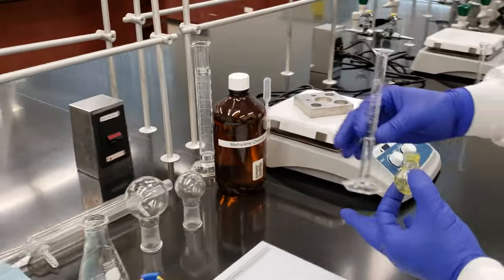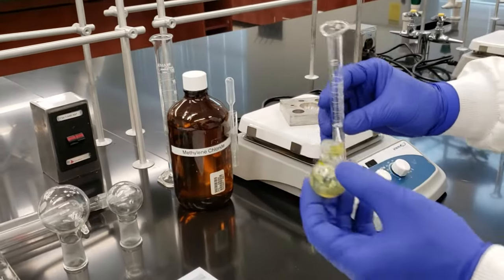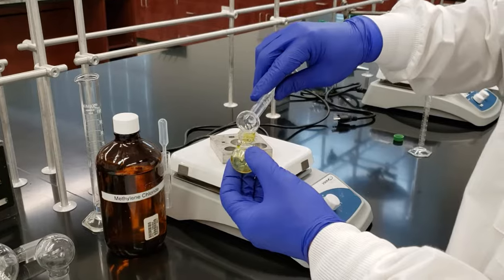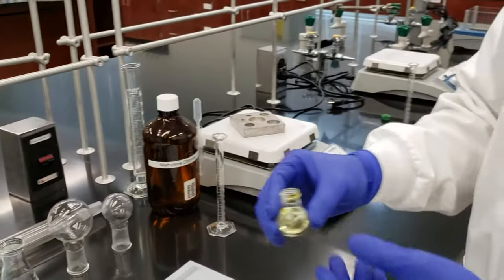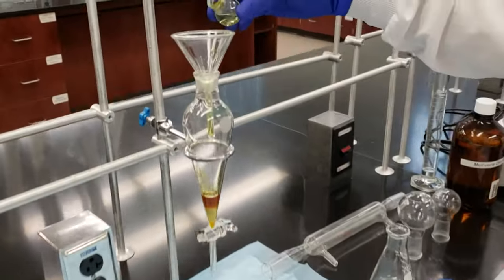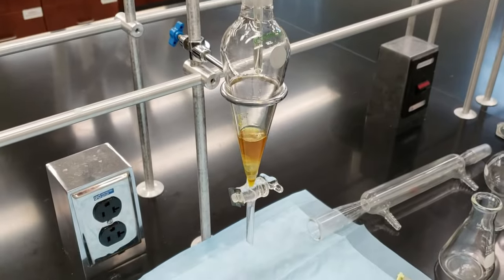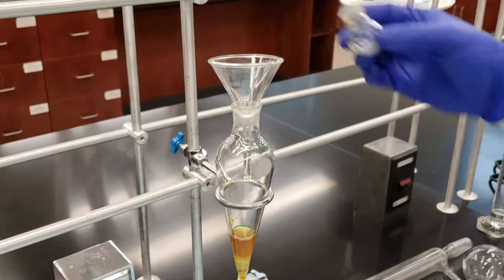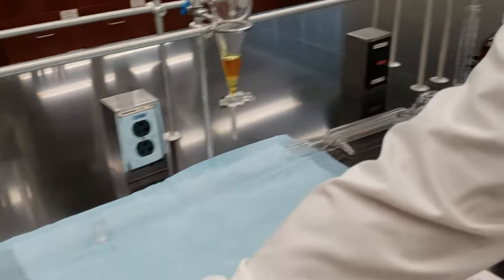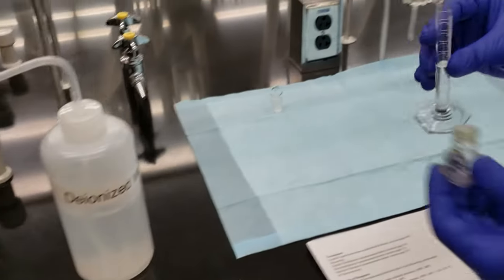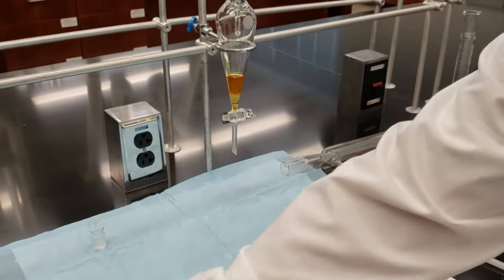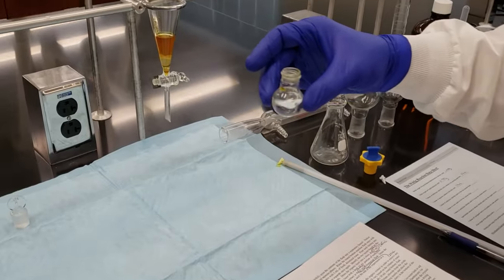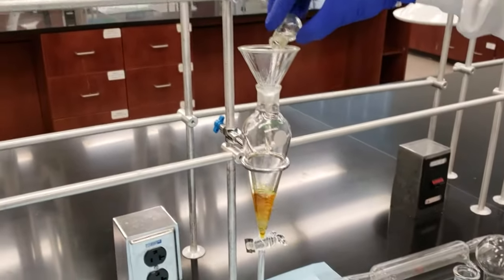The first rinse that we're going to do is five milliliters of methylene chloride. That will go into our reaction vessel. We're going to try and get out anything remaining, any of our product that remains. We'll swirl that and we'll pour it down into our separatory funnel. Next, we'll take a five milliliter portion of deionized water. We'll pour that into our reaction vessel, give that a second swirl, and then pour it into our separatory funnel.